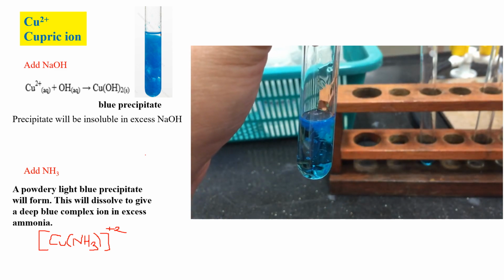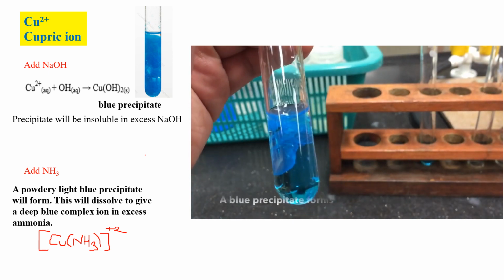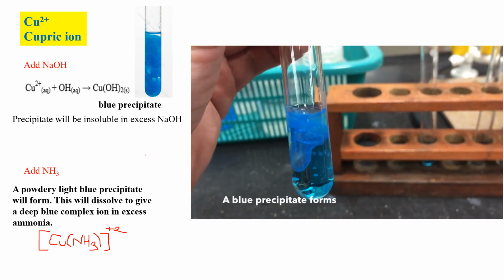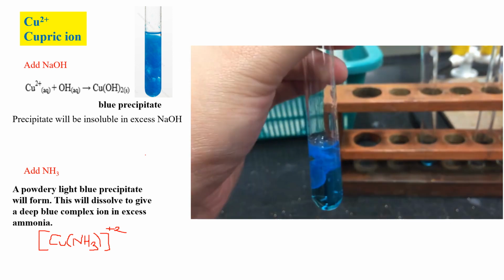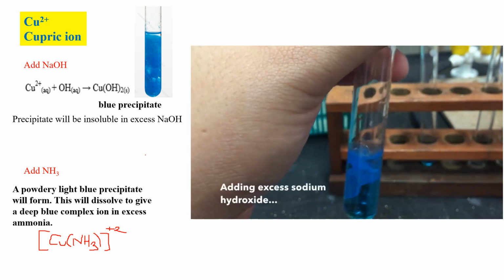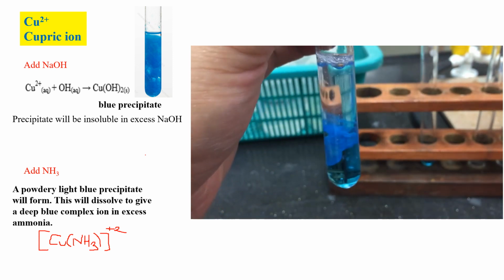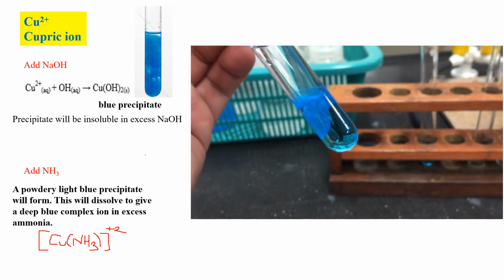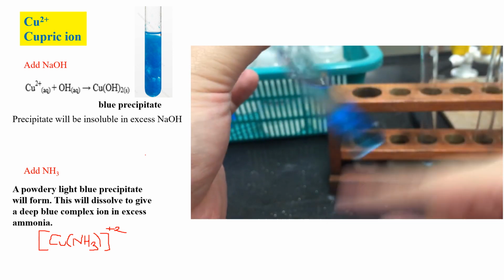Next, add an excess of sodium hydroxide. Shake the test tube to ensure thorough mixing. You will notice the blue precipitate remains insoluble in excess sodium hydroxide.